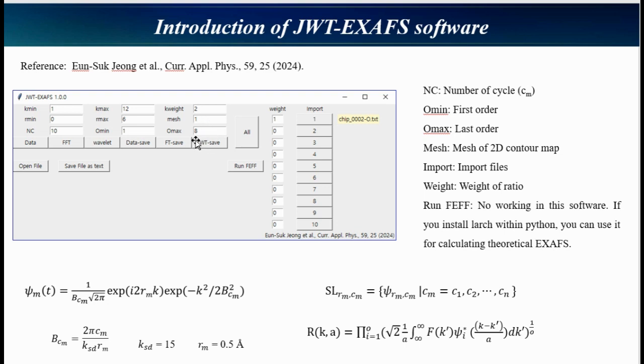The data files are input by the import card, and their amplitude can increase or decrease using the weight ratio. Running FEFF does not work in this software. If you install LARCH within Python, then you can use it.